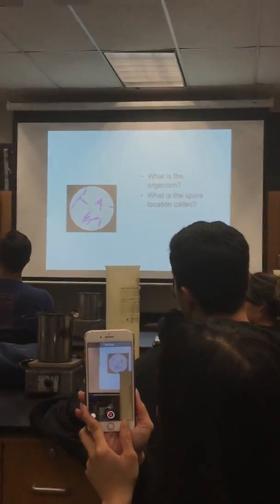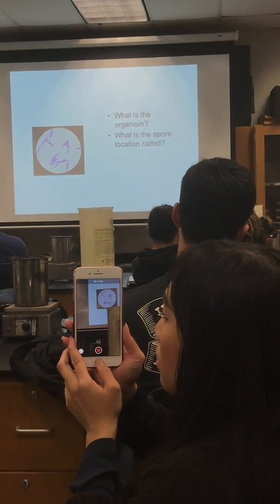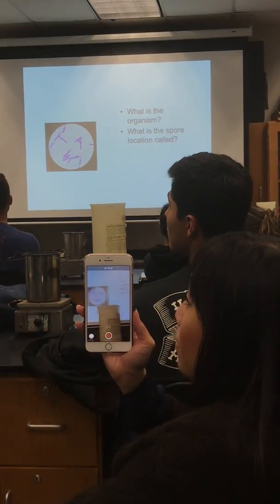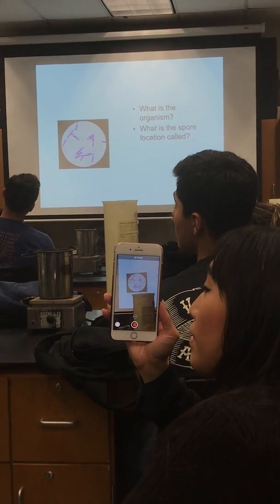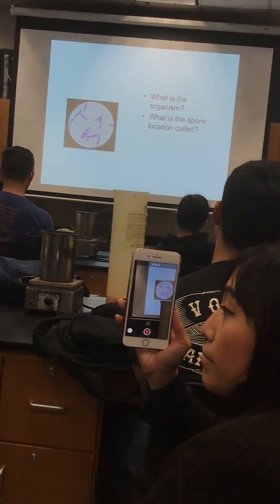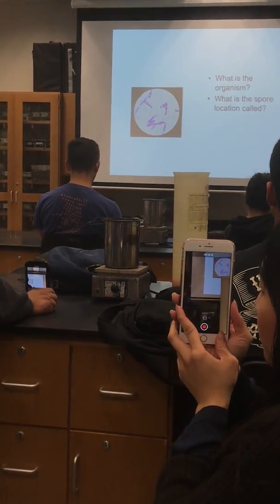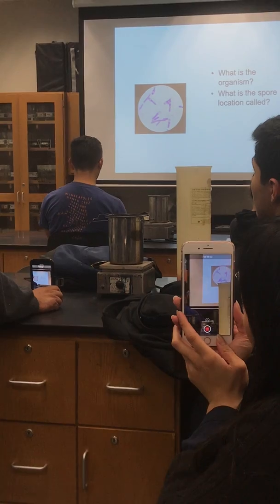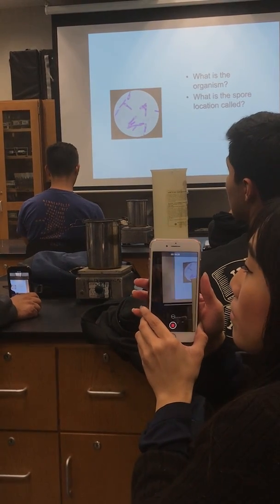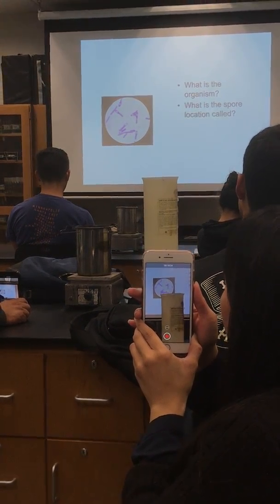One of the things on the practicum is we'll go through the slides and then I'll go through them a second time. Because what's going to happen is you see a slide and you say, oh, that's Clostridium botulinum. And then 4 slides later you say, oh, that looks like Clostridium botulinum. Because they are difficult, and I've tried to pick slides that really are characteristic of what we're talking about, because sometimes it's really hard to see. Now, obviously, in a clinical setting, from symptoms and everything else that's going on, you're not going to say it's botulinum when it's tetani. So, where is the spore location? What's that called when it's not totally at the end? What's it called if it's at the end?